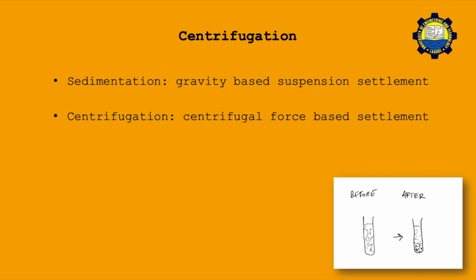Centrifugation, however, is a process where you're making use of a centrifugal force instead of this gravitational force for those suspensions to settle at the bottom. Separation through sedimentation could be done naturally with the Earth's gravity, but again, that would take a lot of time. To speed up that process, centrifugation is just making that natural process much faster. It's a technique used for the separation of particles from a solution according to their size, their shape, the density, viscosity of the medium, and the rotor speed.